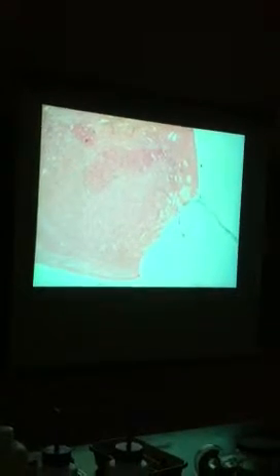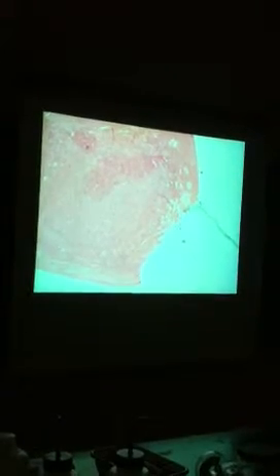Move it over this way. So starting from there and moving over, all that section right there would be more considered a corpus luteum. It looks a little different than the background. It's not a good one, so I'm going to try to find you a good one. A dark spot? Nope, the whole little section from here all the way over. The dark spot's just included.